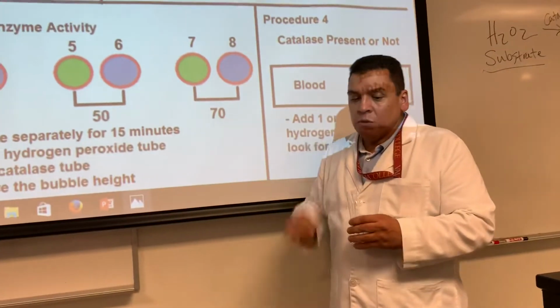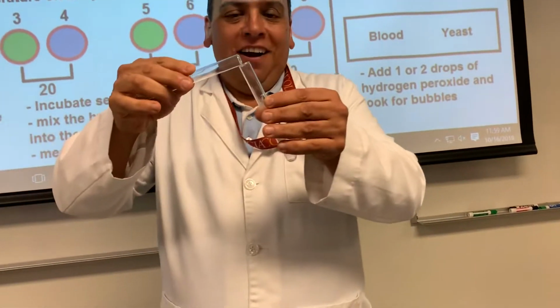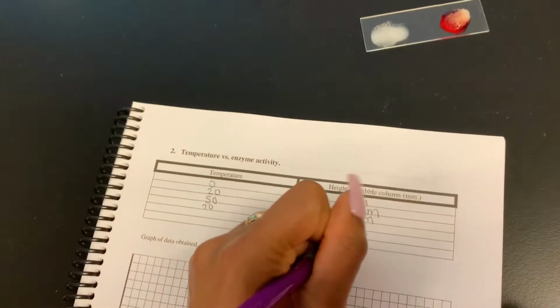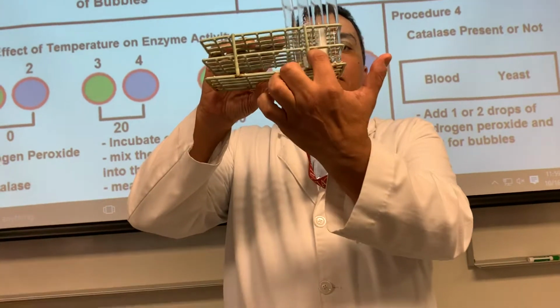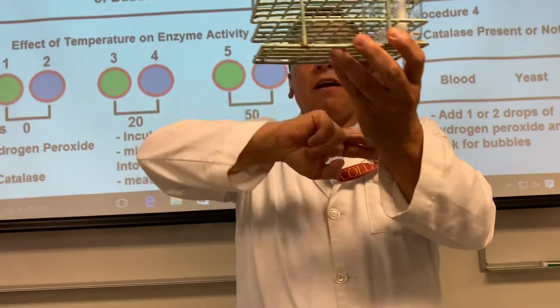What's your prediction with this one? Flat, 0. I hope. All right, let's see. Thank God it did not embarrass me here. Okay, good. 0. Wait, we forgot to say wow in the previous one. It's okay. I'll forgive you. All right. Pretend as if the rest of these all popped, but the top of it is right here. And there's your graph right there.